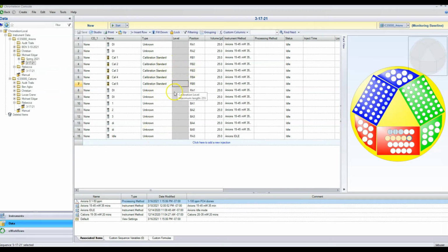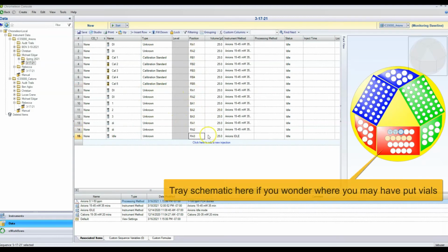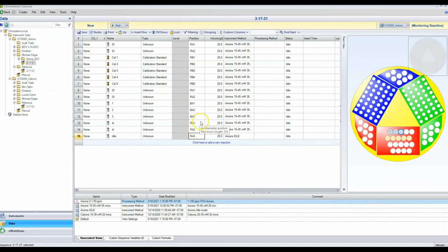So now let's put in all of our locations. Our DI waters, at least for us, are always going to be RA1, RA2, or RA3. So let's make sure that all of our DIs are there. These ones are not, so let's change that to RA1, RA2. And remember, this is just because we put these in the red. These are the big 10 milliliter vials that are in that red tray. And our calibration is right below that, right? So RB1, RB2, RB3, RB4, and RB5. Now, remember we put our samples in, I believe it was GE1, GE2, and GE3. All right.